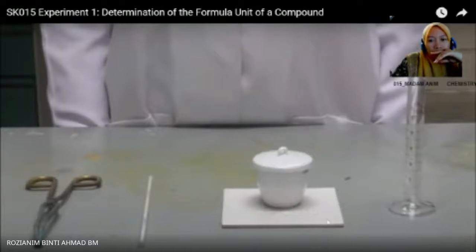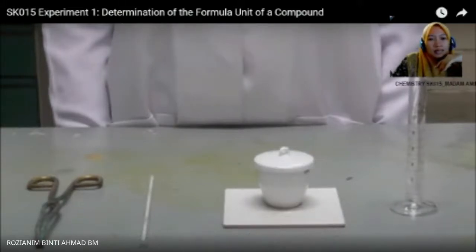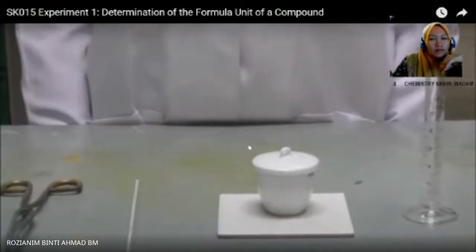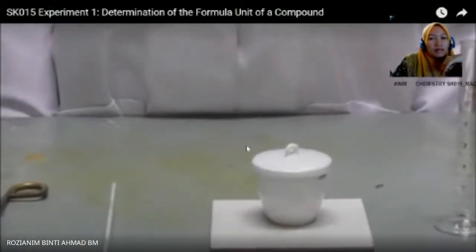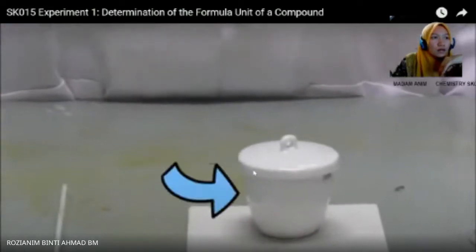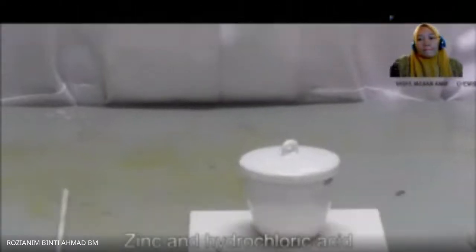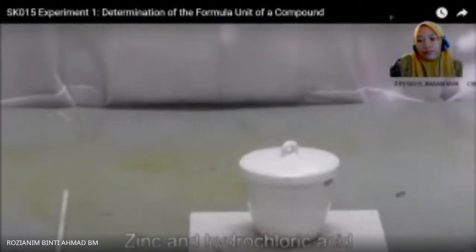In a sample needed. Zinc chloride is produced. Dah full dah ni. Tak apa, you go through dulu, tak apa, nanti saya akan discuss lagi according to the content of this video. And after this class, I akan forward sekali lagi link video for this experiment untuk guide you untuk buat writing report. Zinc and acid will be mixed in this crucible.